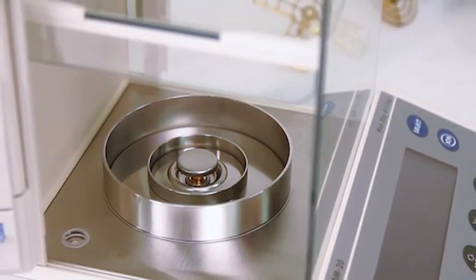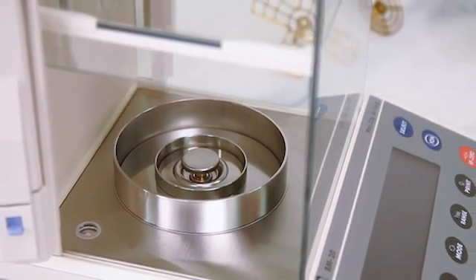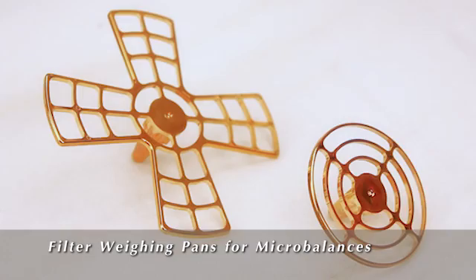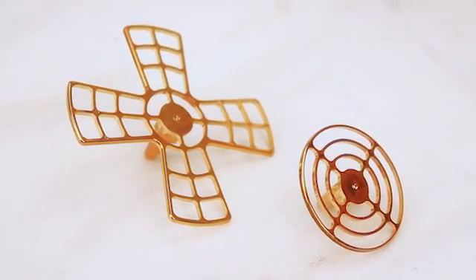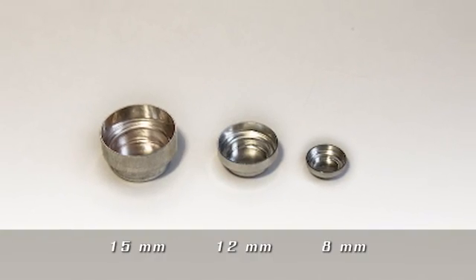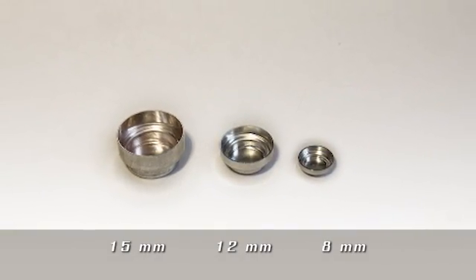The BM20 and BM22 also come with two extra pans, specially designed for filter weighing, and a supply of disposable weighboats in three different sizes.